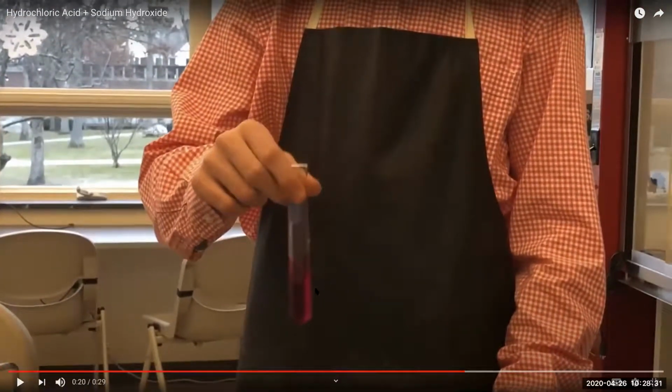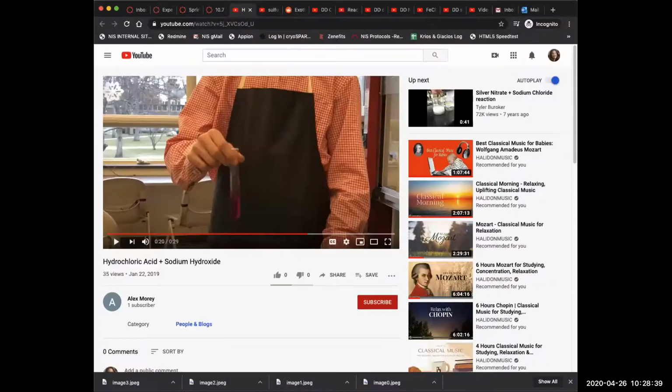So here there's extra NaOH. This wasn't the best video, but what I would like you to write down is that he added a little bit too much base because you can see that it's pink; it should have stayed neutral. So for this, we could just say that it remains colorless, right? And there should have been some slight heat generation. Apologize for the subpar video there.